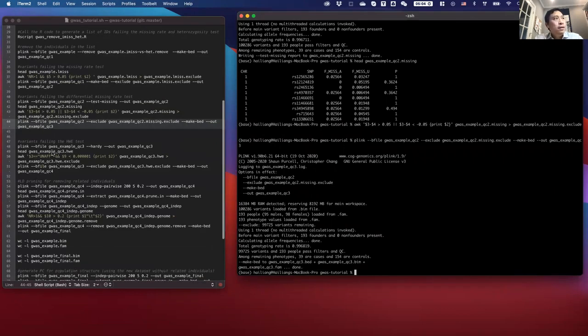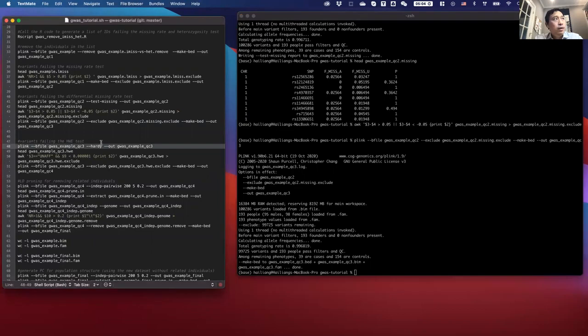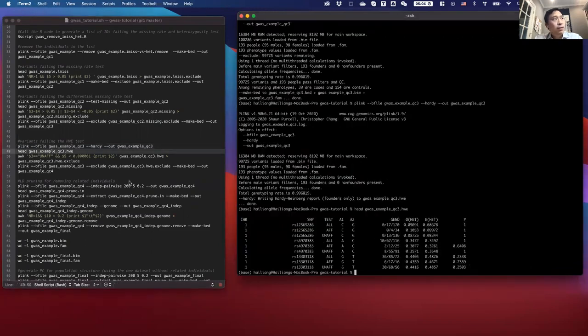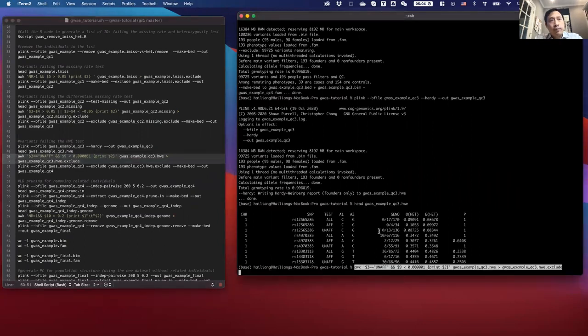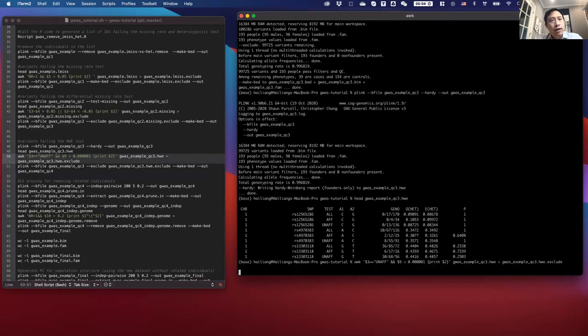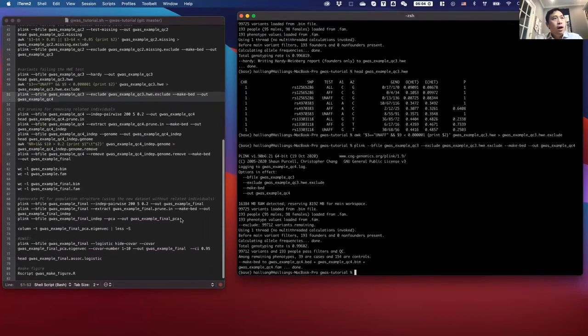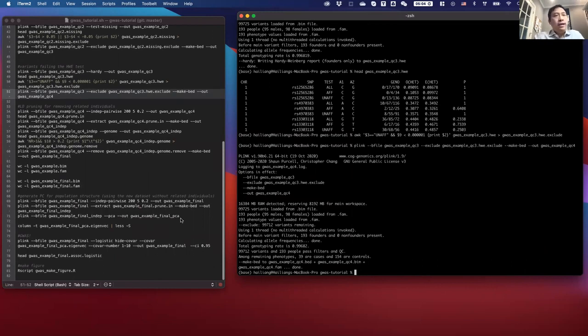All right. The last thing we want to do on the SNPs is the Hardy-Weinberg equilibrium test. This can be done by using the --hardy command. This is a list of SNPs with their Hardy-Weinberg p-value. We want to only use the Hardy-Weinberg test for the unaffected samples, and we want to use a p-value of 10⁻⁶ as a cutoff. We filter for such SNPs, and we use PLINK to remove those SNPs. All right, now you have a data set that is relatively clean for individuals and for SNPs.